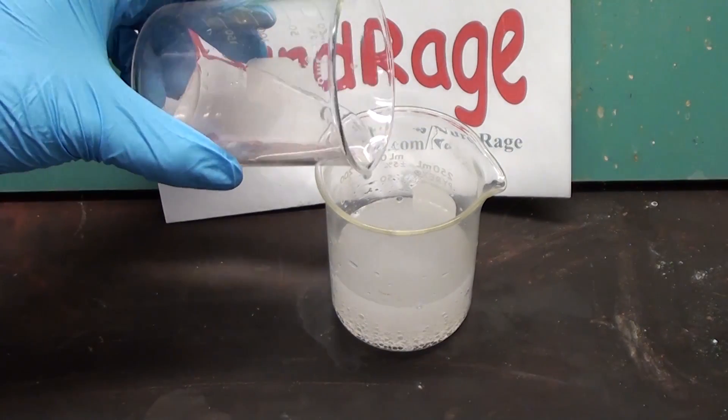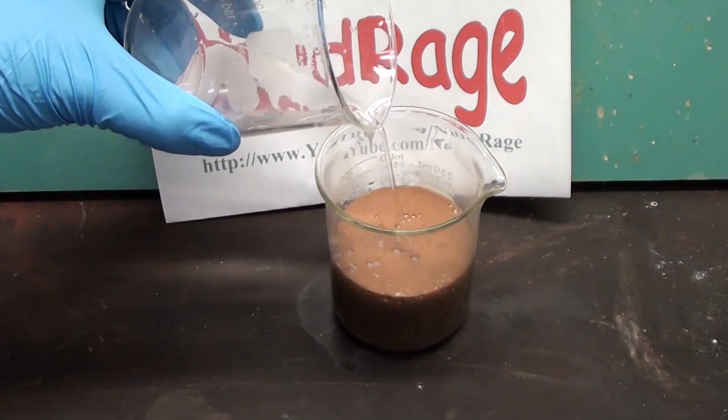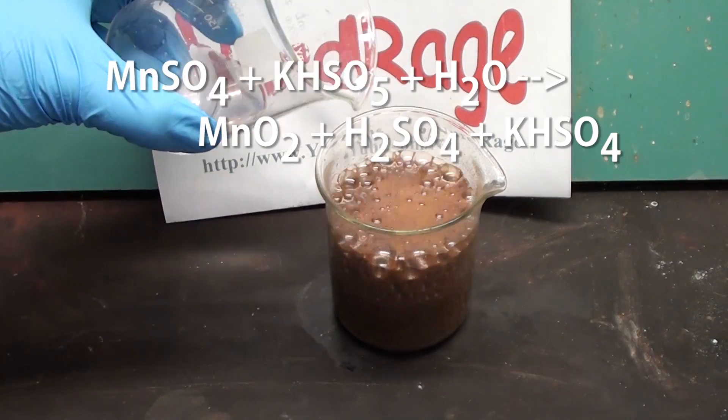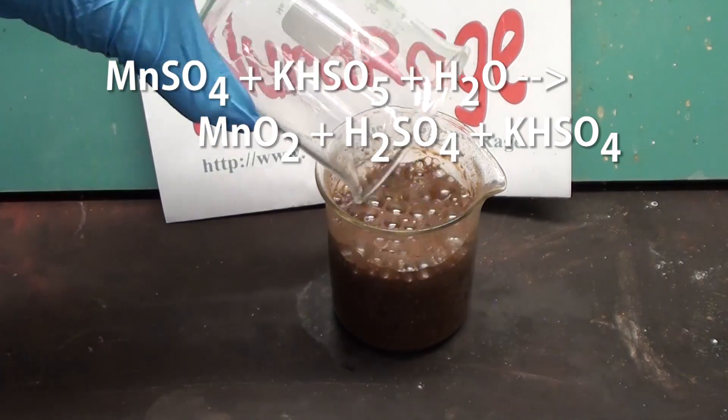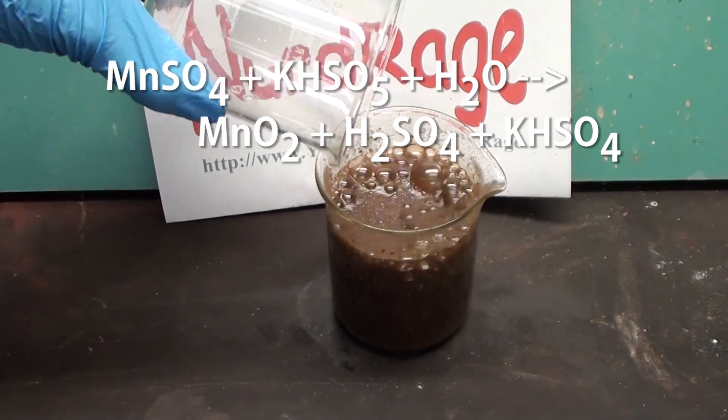Now add the manganese sulfate to the solution. The manganese dioxide will quickly precipitate out. What's happening is the potassium peroxy monosulfate oxidizes the manganese sulfate into manganese dioxide and sulfuric acid.